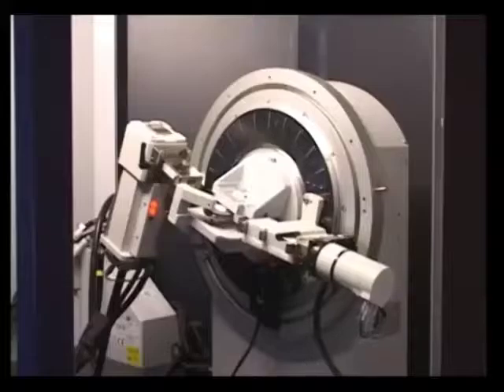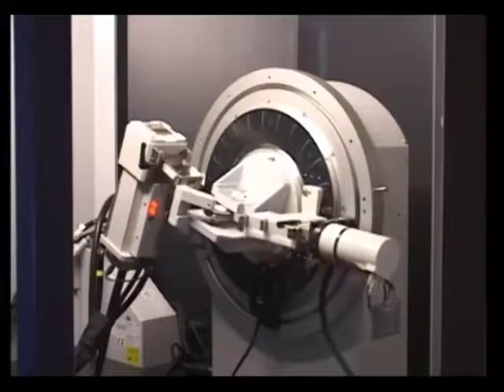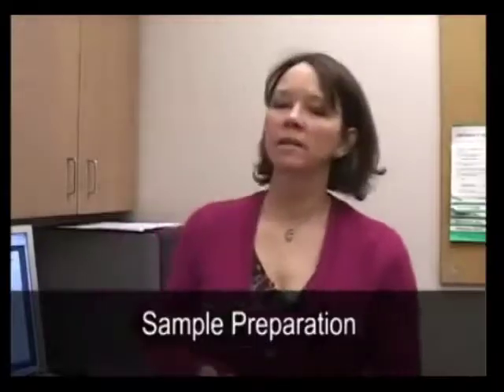During a scan, the detector is rotated over a range of angles to detect bands of diffracted X-rays produced by the correctly aligned crystals within the sample. So now we're going to discuss sample preparation.